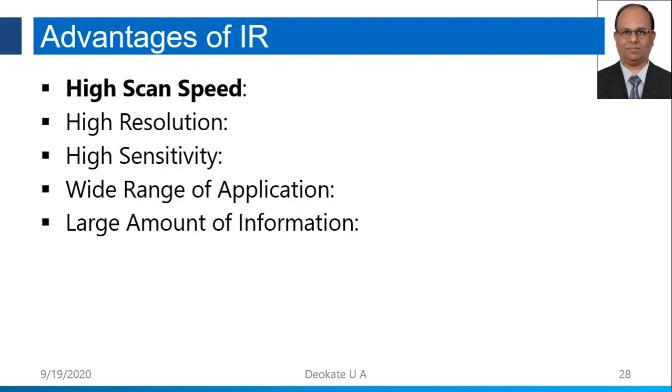So this information is available when you are doing infrared spectroscopy, and depending upon the available information from the functional group part and fingerprint part, the infrared spectrum has become of great importance in the process of structural elucidation. Structural elucidation means detecting the structure of a compound. Okay, so that is another important application of infrared spectroscopy.